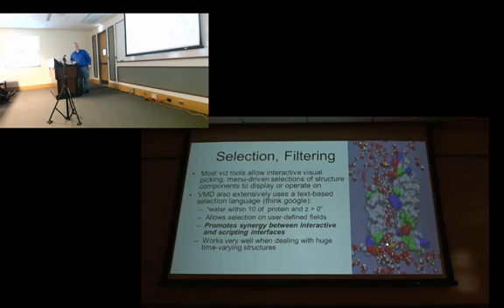But there might be tricky things, like in this case, we have an aquaporin channel, and the key activity of this structure is to filter water. Aquaporin channels are, for example, in your liver, and your body filters something like a bathtub full of water every day through your liver. It does it by passing those waters through these very selective channels. If you want to make an informative image of how that channel works, you want to show waters, but you only want to show the waters that are passing through the center of that channel that are doing something interesting. And so that's where VMD has a particularly sophisticated feature, which is an atom selection language.